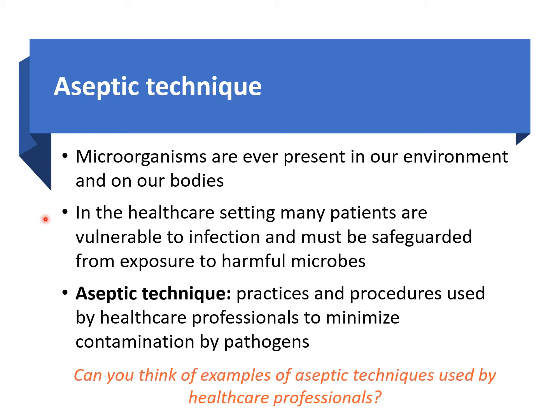Now, in a healthcare setting, for example, there are lots of patients that could be vulnerable to infections, and therefore these patients must be safeguarded from getting exposed to these harmful microbes. So it's pretty important for us to discuss aseptic techniques that are practiced by healthcare professionals to minimize exposure to these harmful microbes, or as we refer to them, pathogens. Basically, minimize the contamination, right?